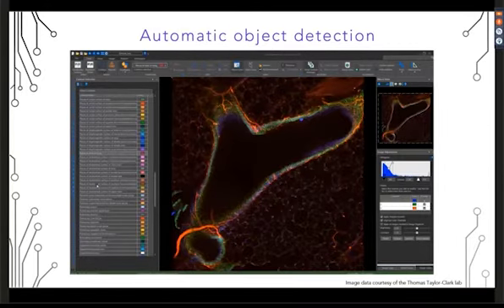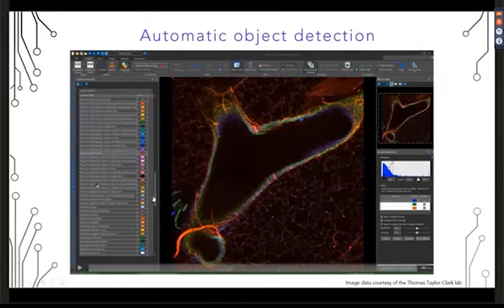One of those segmentation tools can be used to automatically delineate objects within your image data. To begin, load your image into the program and access the relevant vocabulary list following the instructions that Aiden demonstrated earlier. For multi-channel image data, use the image adjustment window to isolate the channel that you'd like to detect objects in.